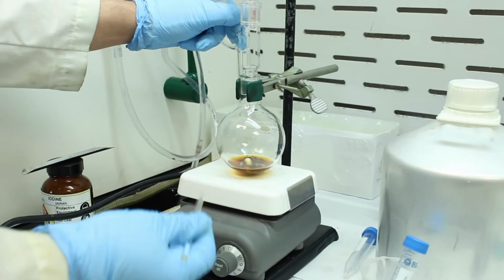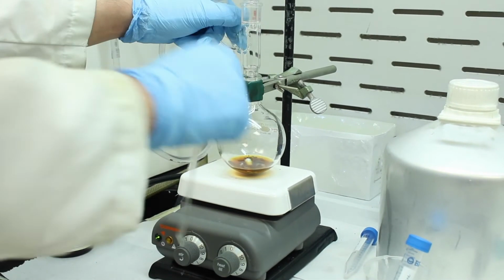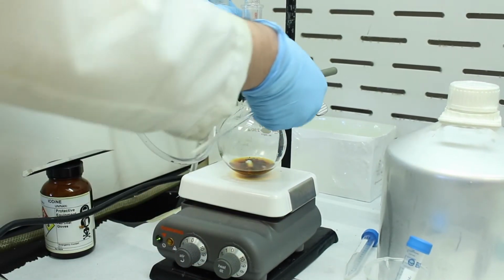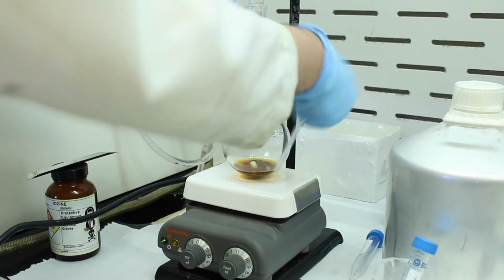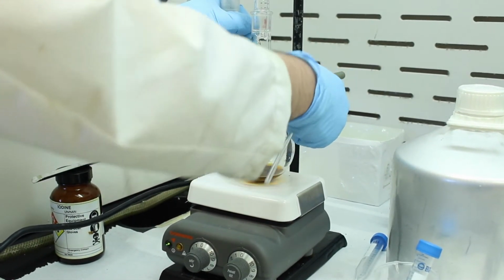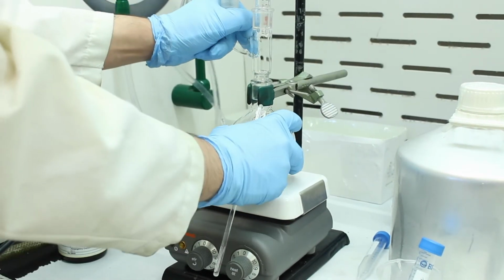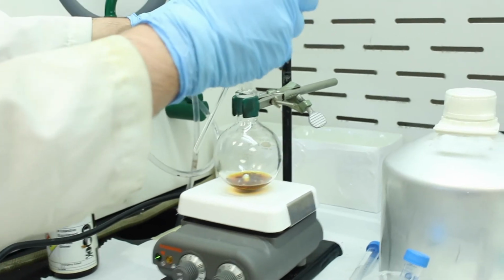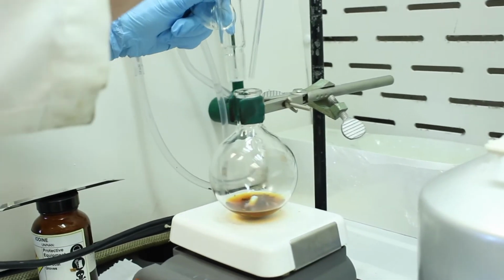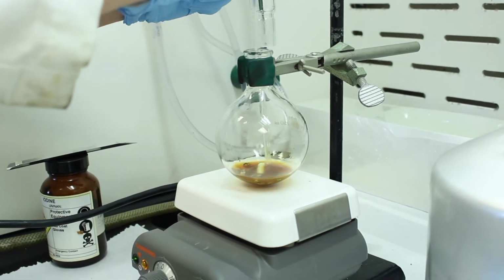The risk here, though, is punching out the bottom of the flask. It has happened where students jam it too hard and it cracks the flask or breaks the stir bar or the glass stir rod, so you do have to be a little careful. Oops, sorry, wrong one. Keep that clamped. We'll take this out. Okay, and it's as crude as you would expect. You simply take the stir rod and you start jabbing at it.